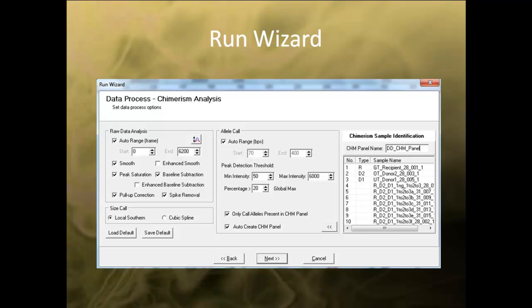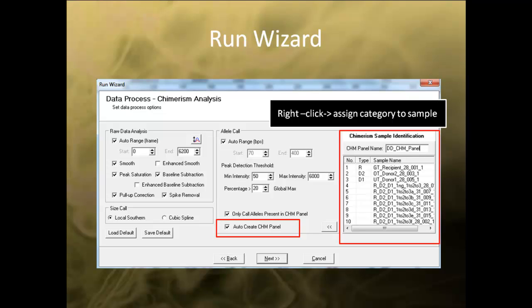Once identification has been set, you can access the Run Wizard through the Run Wizard icon. In the first window, follow the same procedure discussed in the introductory webinar to select the panel and size standard, or select a template appropriate for the data. In the second window, select Auto-Create Chimerism Panel. If you have not set the identifiers for the sample, you can right-click on a particular sample and assign a specific category. Finally, assign a name to the panel, click Next, and then OK to begin the analysis.